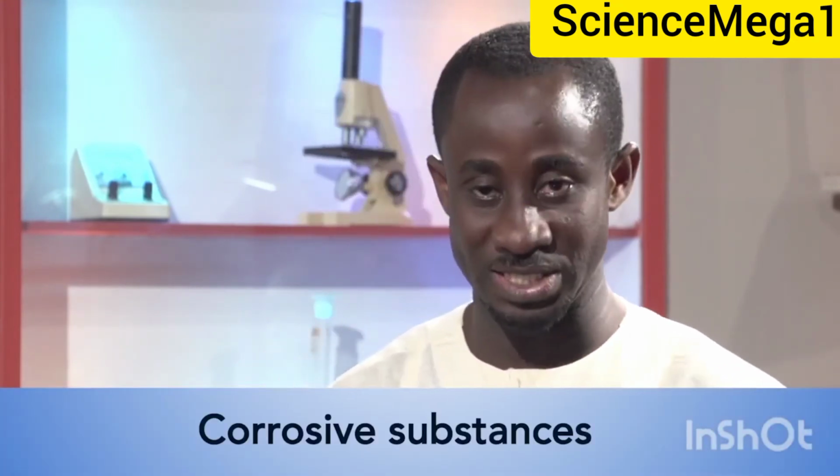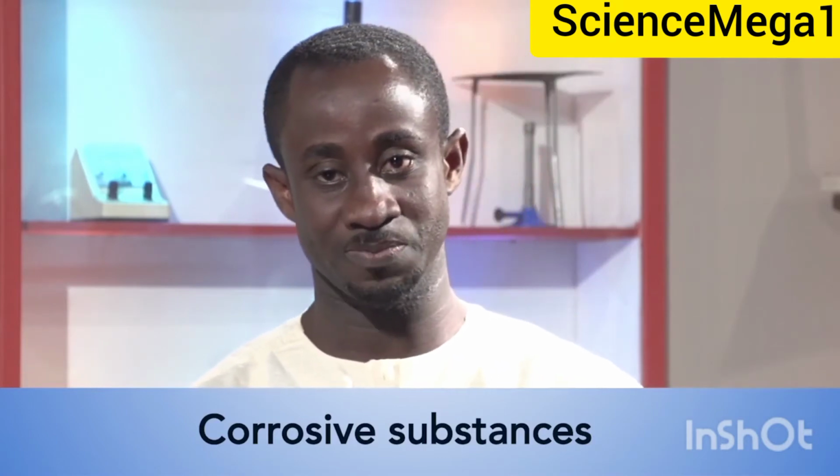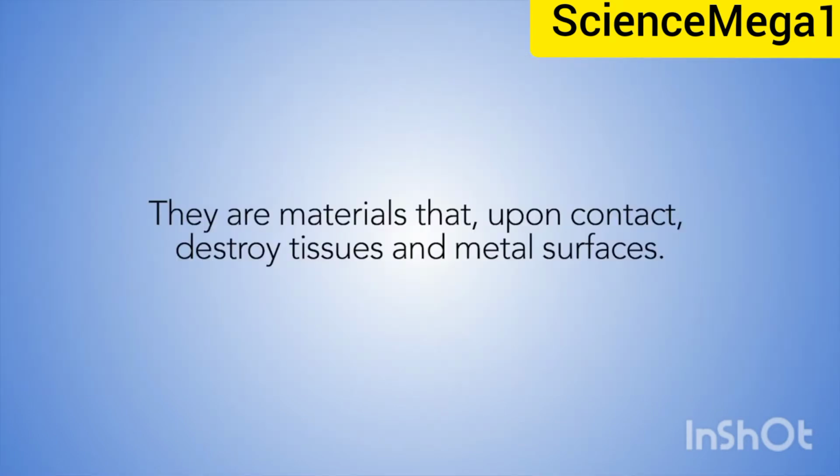The hazards associated with the chemicals in the laboratory include, first of all, corrosive substances. They are materials that, upon contact, destroy tissues and metal surfaces. Examples of such substances are concentrated acids and bases. They are identified with a label on their bottles bearing the warning sign.